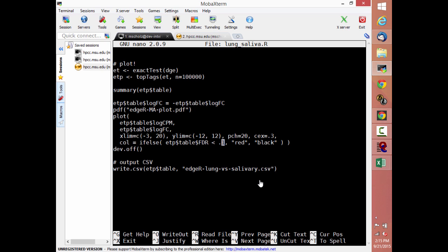And then it prints all of that to a file. It prints out this way on the table because there's a typo in there that I haven't bothered to fix, so that it doesn't print with the $ signs and makes more useful labels. But these are just the labels on the chart here. And then the last thing it does is print out the table named whatever you want. So this is actually all you have to do with EdgeR.